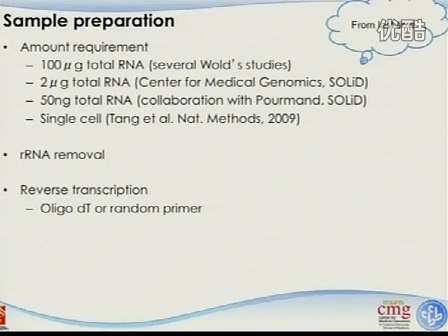Another problem of using oligo-dT is the 3' end bias, because those RNAs will be degraded, and every single molecule measured has to have the 3' end to be able to reverse transcribe. So you will see much higher signal towards the end of the gene if you use oligo-dT only. And you can use random primer, but you have to go through those ribosome removal steps.